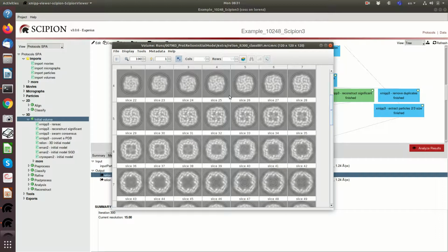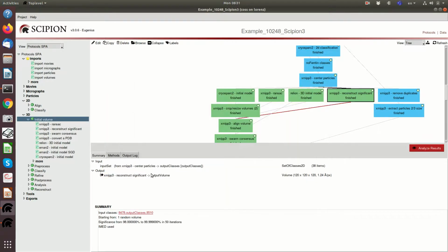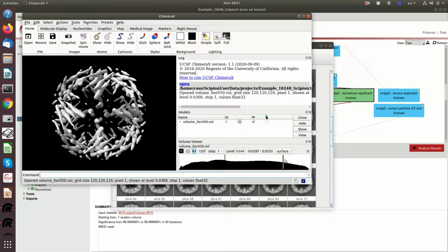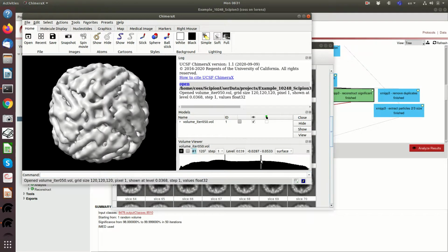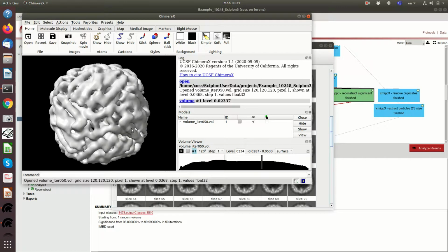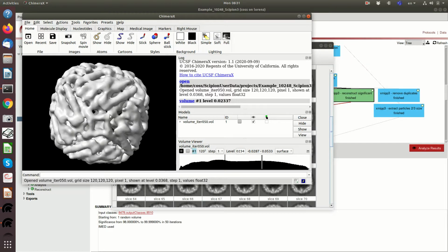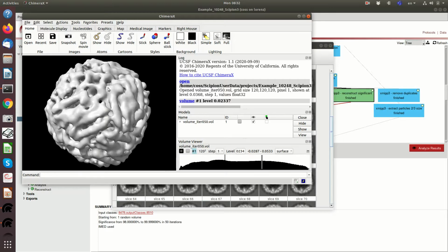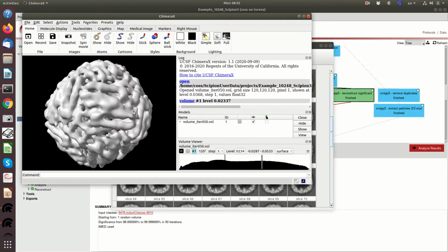But it is very low resolution. And for significant we can also see, I think, these 4 corners. So we see 1, 2, 3, the 4 corners, but you see that the internal details of the structures look rather different between significant and Relion, and the different initial volume algorithms.